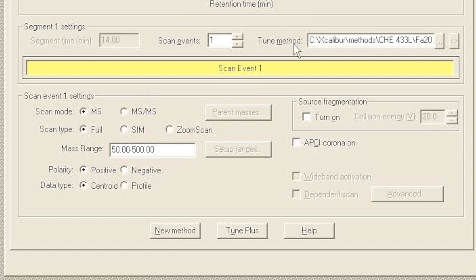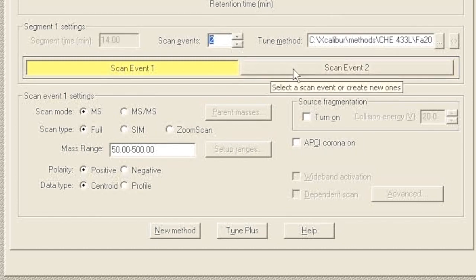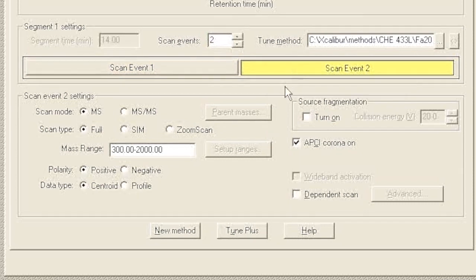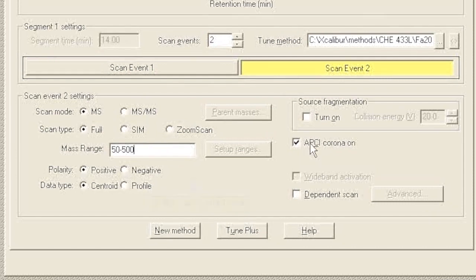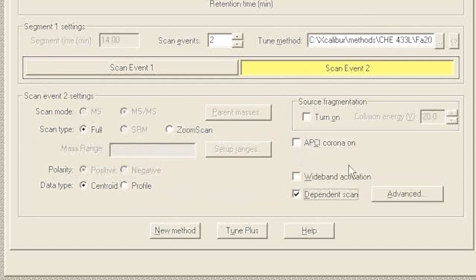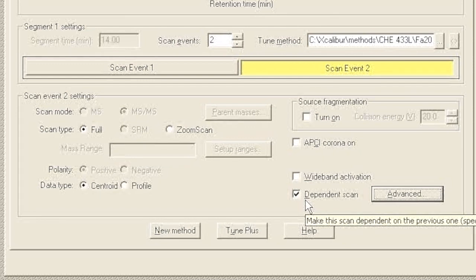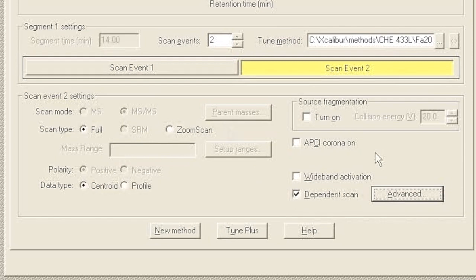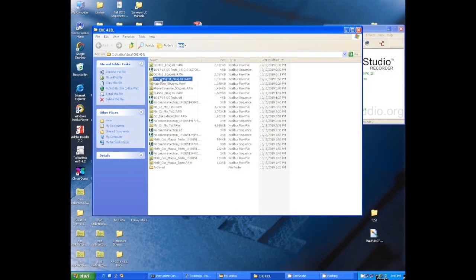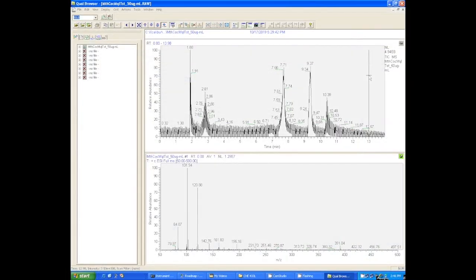But in this method we can run one run and get MS and MS/MS spectra in the same run. We need to add what's called a scan event. We're going to say we want two scan events. Scan event one is going to be the MS - that's all set just like it was before. For scan event two, we're going to make sure the mass range is right - again 50 to 500. Really importantly, we're going to click that dependent scan button, and that means it is going to choose this MS/MS scan based on the scan one MS data.